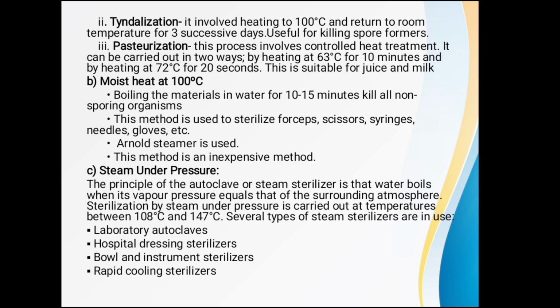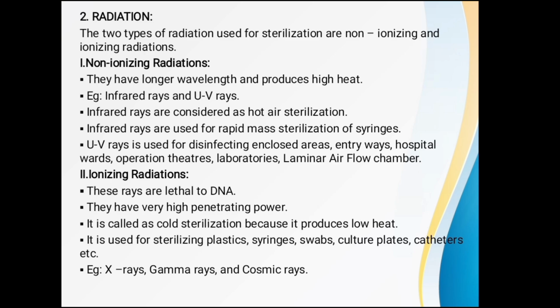Steam under pressure. This is the principle of autoclave or steam sterilizer: water boils when its vapor pressure equals that of the surrounding atmosphere. Sterilization by steam under pressure is carried out at a temperature between 108 degrees Celsius and 147 degrees Celsius. Several types of steam sterilizers are used: laboratory autoclaves, hospital dressing sterilizer, bowl and instrument sterilizer, rapid cooling sterilizer.